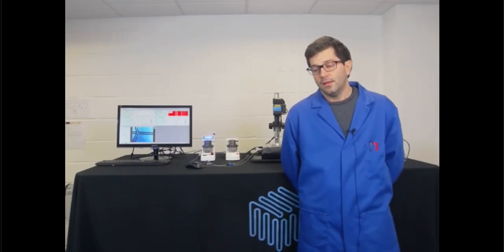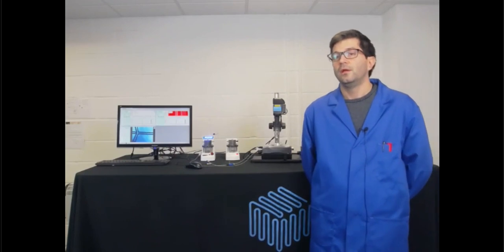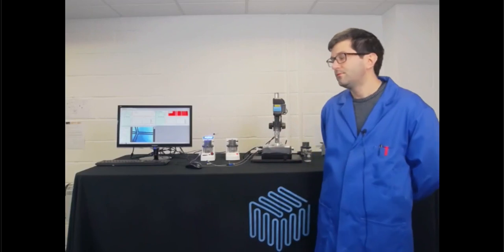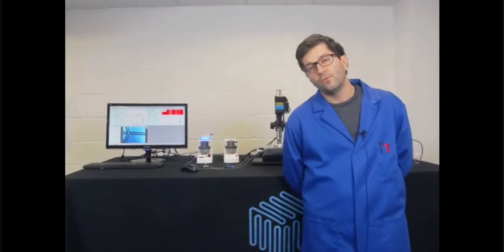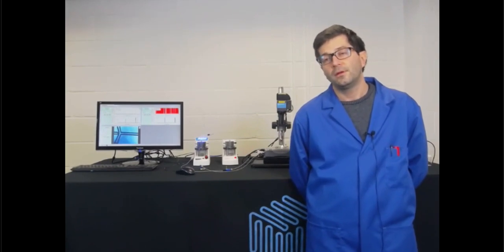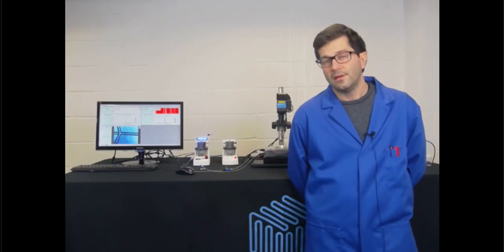We are particularly interested in and focused on applications around particle engineering, particle production for drug delivery and drug application. To do so, we use microfluidic systems as a tool, one of which is the one you see here in front of me. Today's webinar is about the use of one of our systems for the reproducible and controllable production of liposomes, nanoparticles, and larger micro-sized particles for drug encapsulation and drug release.